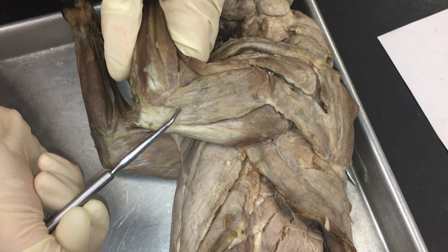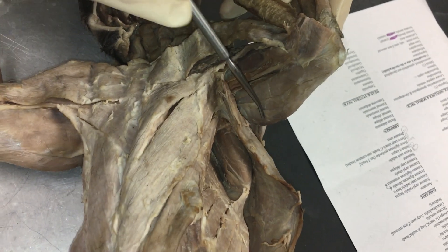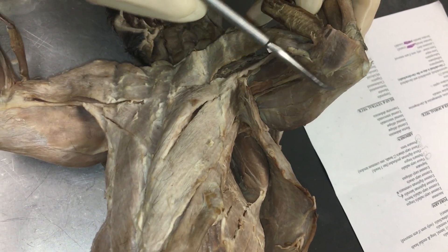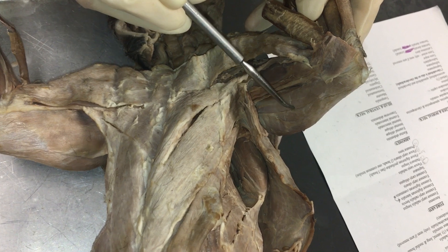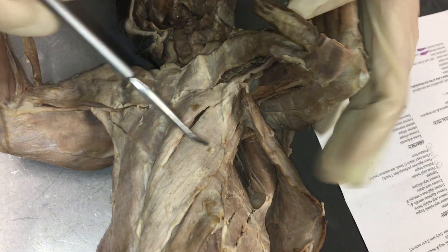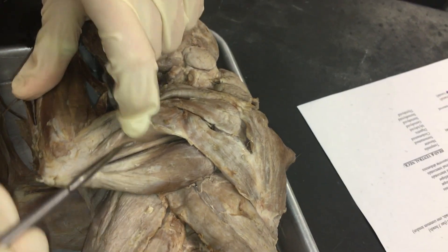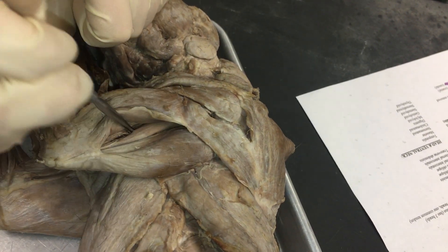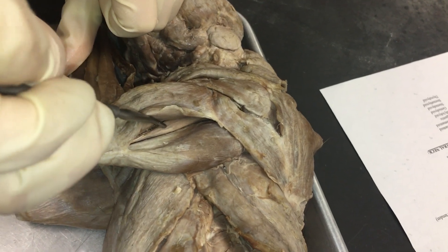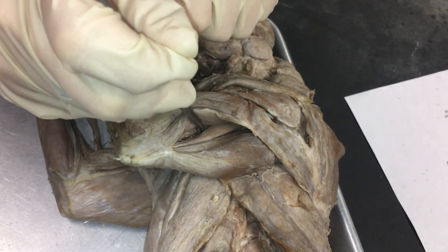Next, we have the triceps. Here is the lateral tricep. Here is the long tricep, which goes all the way to the back here. Don't be confused between this section — it looks like there's a small distinction between this muscle and this, but this is all triceps long. Triceps medial you can see by pulling back here on the inside. So: triceps lateral, triceps long — not a distinction, still triceps long — triceps medial.